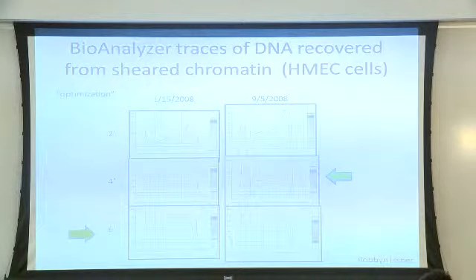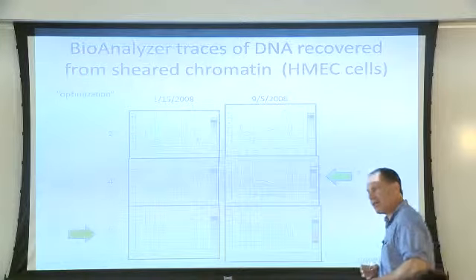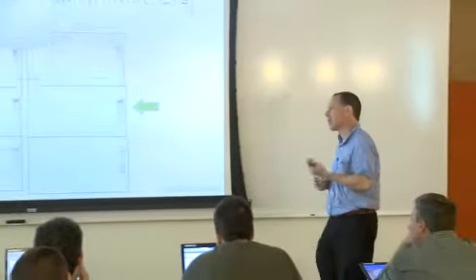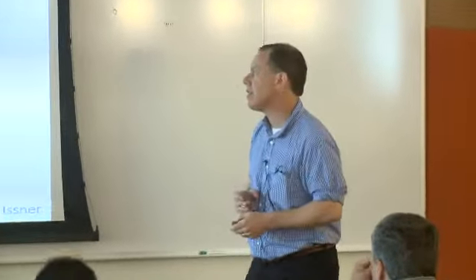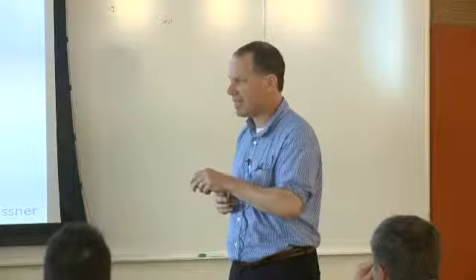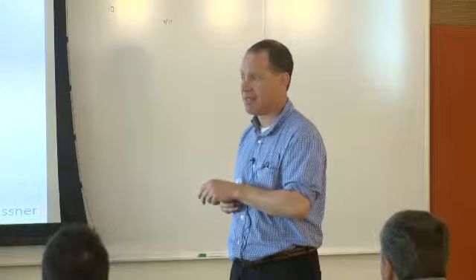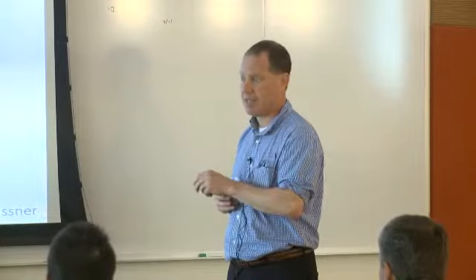Do you do any RNase digestion at all? Do you think it's crucial? We do RNase digestion at the end, during the recovery of the DNA. Oh, yes. This assay here is an analytical assay. It's not a preparative assay. This is a way of seeing what you achieved when you did sonication.